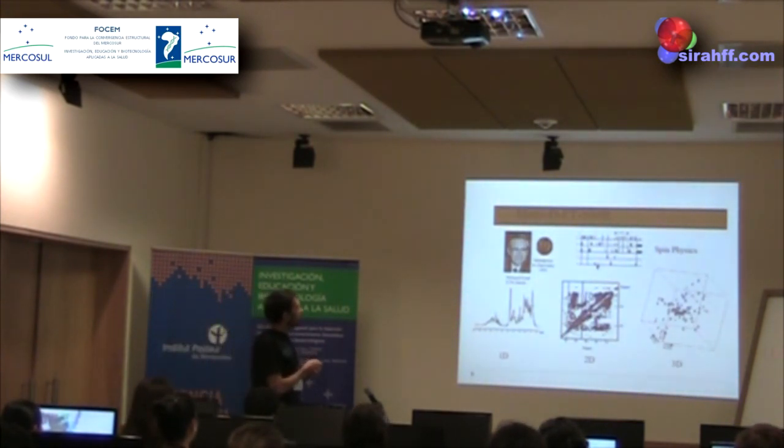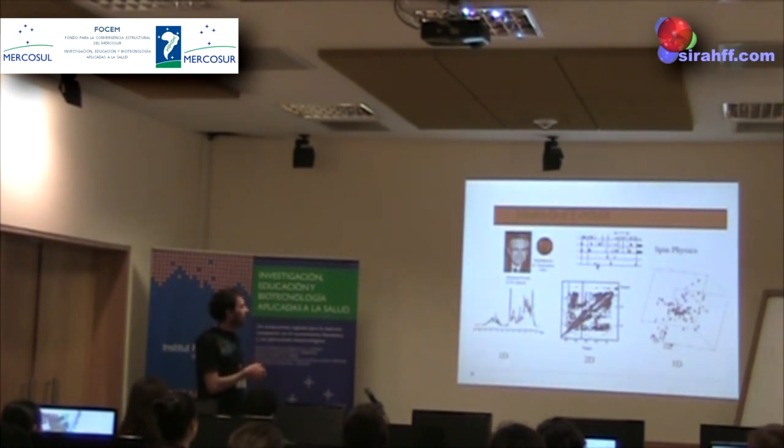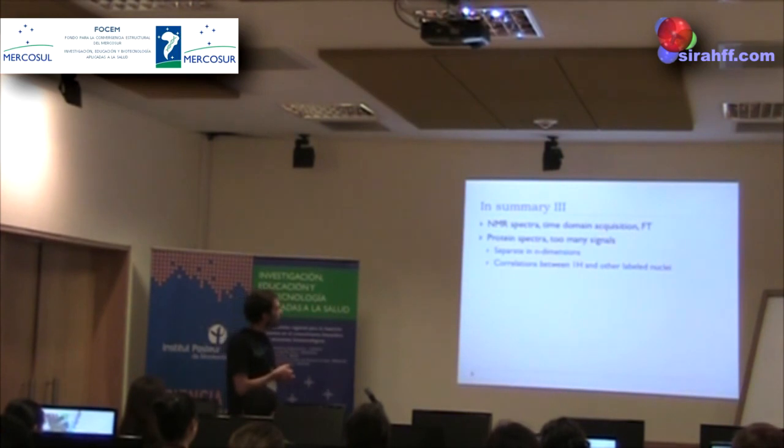So, multidimensional NMR is a great thing, and there was a Nobel Prize awarded because of this to Richard Ernst in 1991. Right? He developed multidimensional NMR.